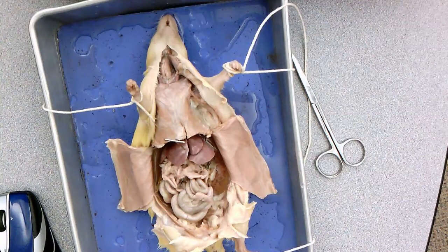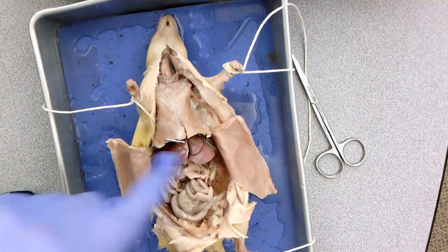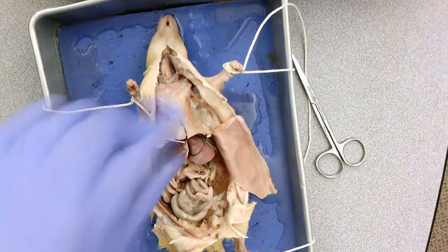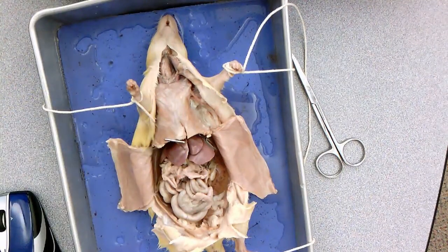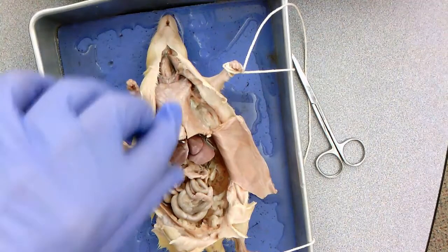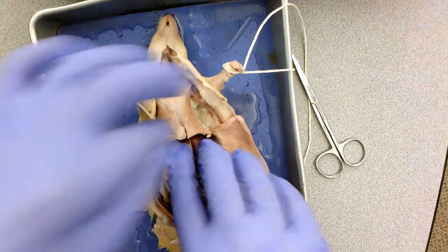In part 2, I have a list of organs that you have to identify. Part 1 was just skinning the rat. Part 2 is going to be identifying these key organs in this abdominal pelvic cavity. Once you get done with part 2, you'll take a picture of those key organs that you have to identify in this abdominal pelvic cavity. Then in part 3, you're going to move up to the thoracic cavity.